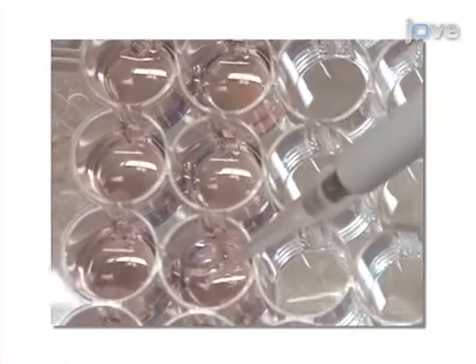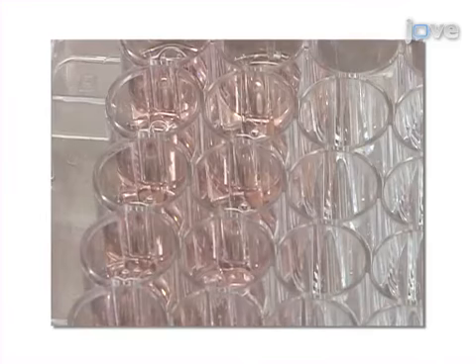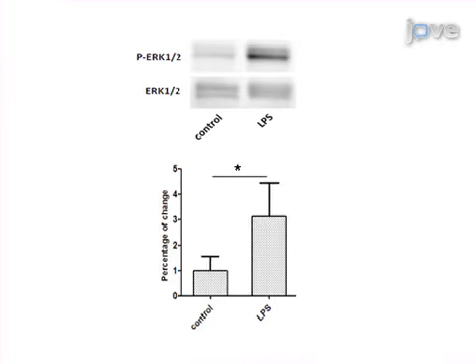The final step is adding a substance of interest, such as cytokines or chemokines, alone or in combination for defined periods of time. Ultimately, RNA isolation, qPCR, immunohistochemistry, and ELISA can be used to analyze the plaque culture experiment.